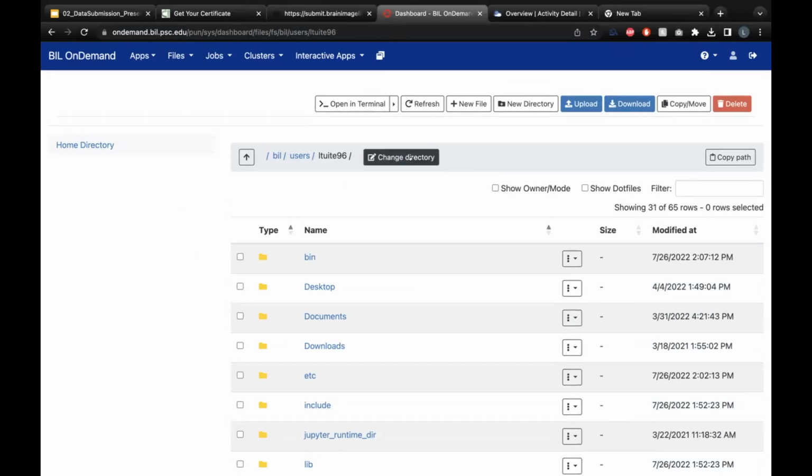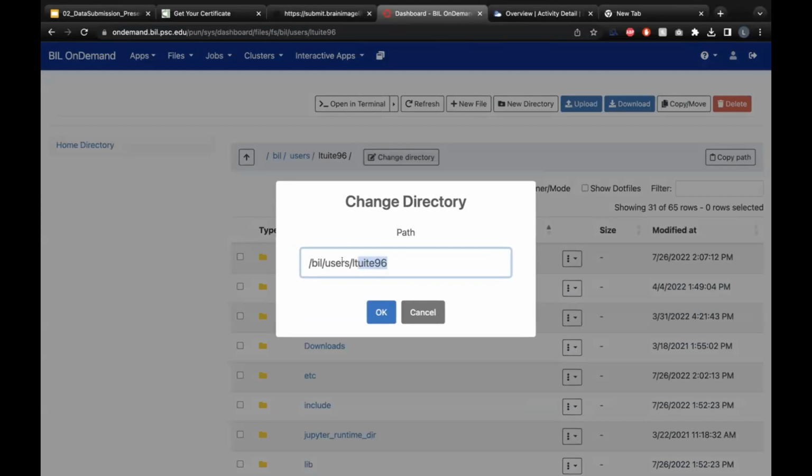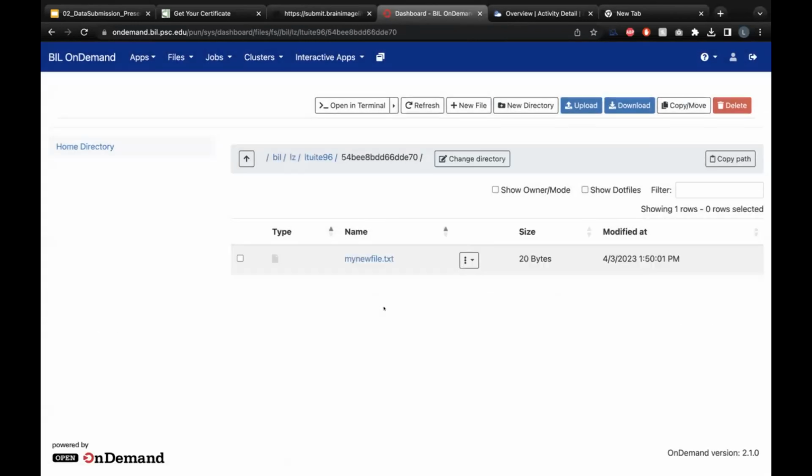If we want to take a look at that file we just uploaded, we can click Change Directory. And you just fill in the directory you created through the portal. So mine is BIL LZ, my username, and this. If I click OK here, I can see that file that I just uploaded through SCP.